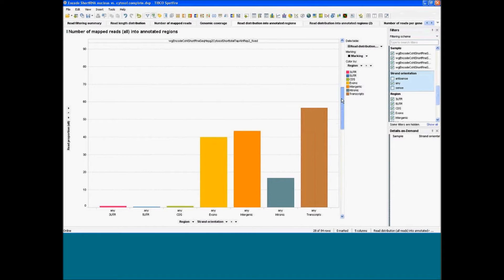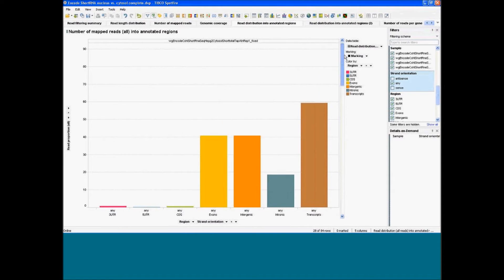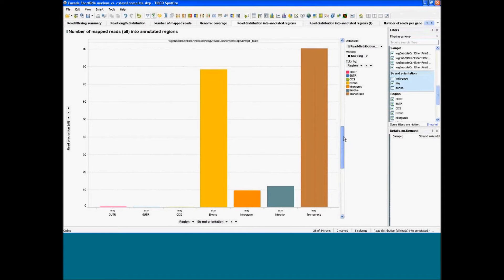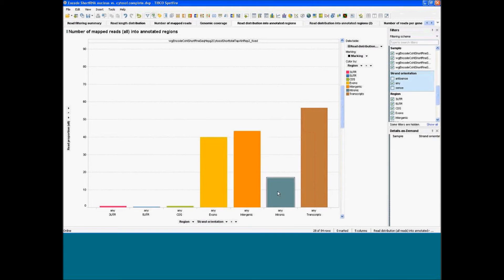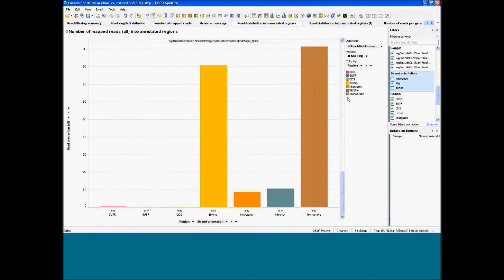Moving further to the nucleus samples, we have a much different profile. You can see much more intergenic and intronic short RNAs in cytosol compared to nucleus, where you have much more exomic reads.